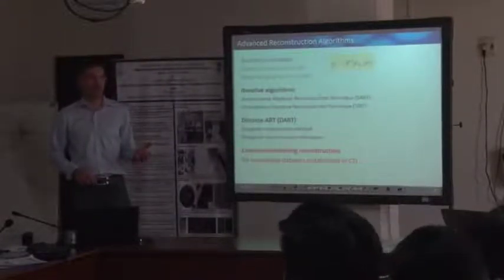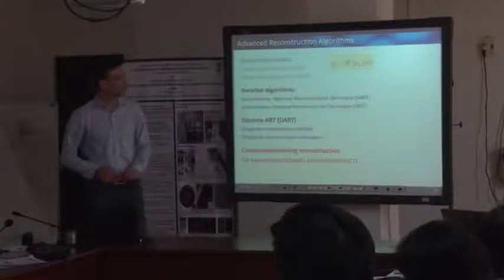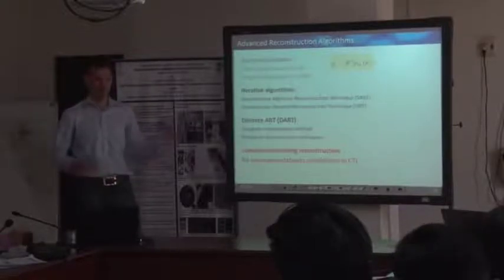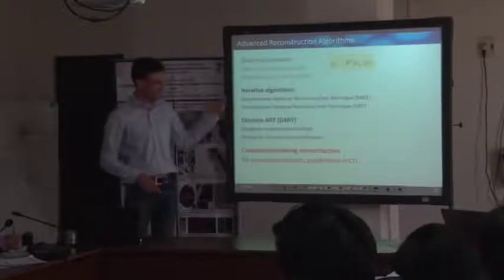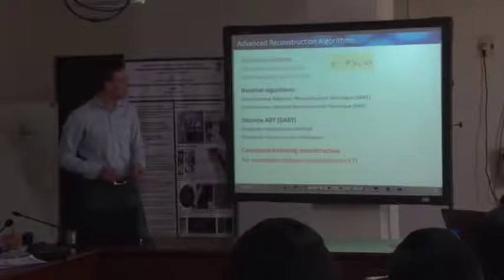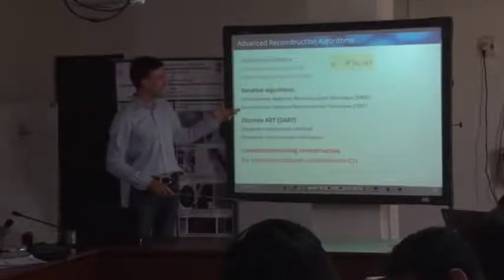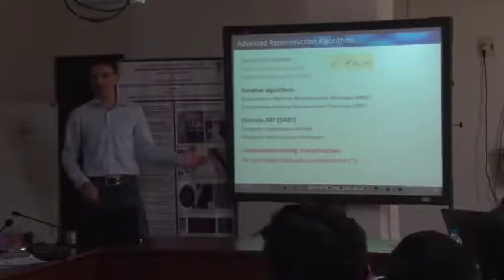One is called IMOD, I-M-O-D. It's a pretty good tool, and there was even a prize awarded a couple of years ago for the development of this IMOD software package by the European Microscopy Society. And I would say the SIRT and this compressed sensing is state of the art for the reconstruction of such data sets.